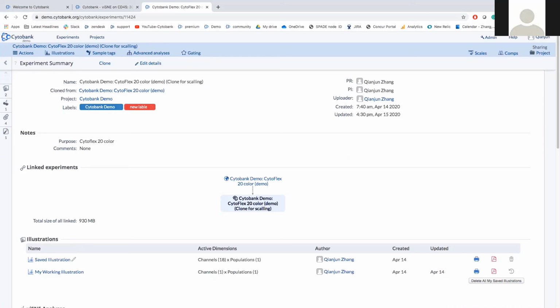I actually have to check if we can use a universal negative or if it has to go from each sample, but I will check that right now and I'll type it back in when I find the answer. Great, thanks for checking, Steph.